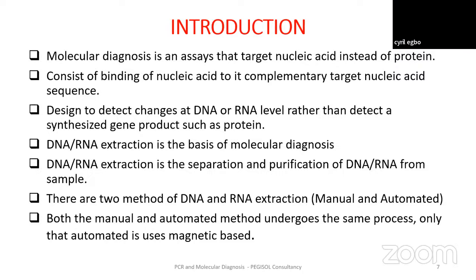of human genetic material or any organism, because you can still do molecular diagnosis for other living organisms. Then DNA and RNA extraction is the basis of molecular diagnosis, because you cannot analyze DNA or RNA with a multiplex PCR machine or real-time PCR machine without having done DNA or RNA extraction.